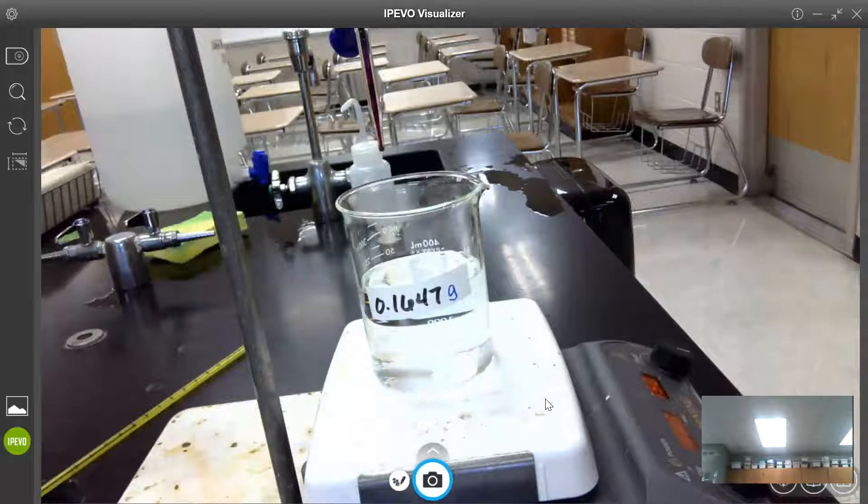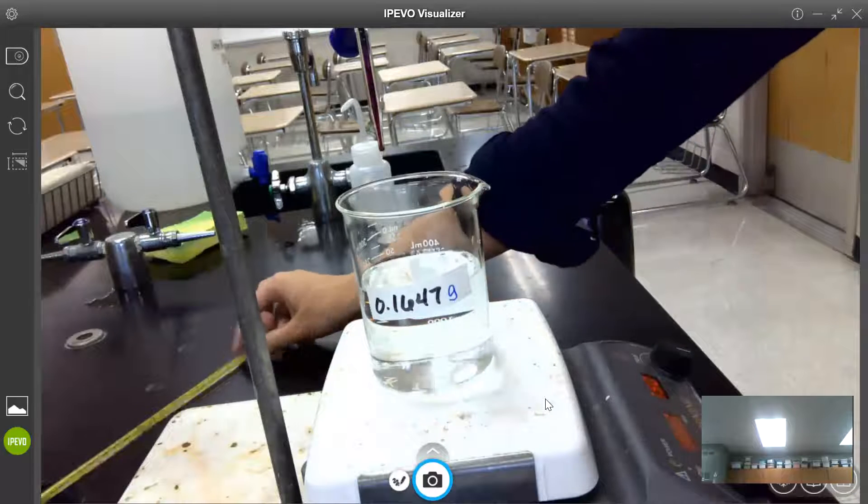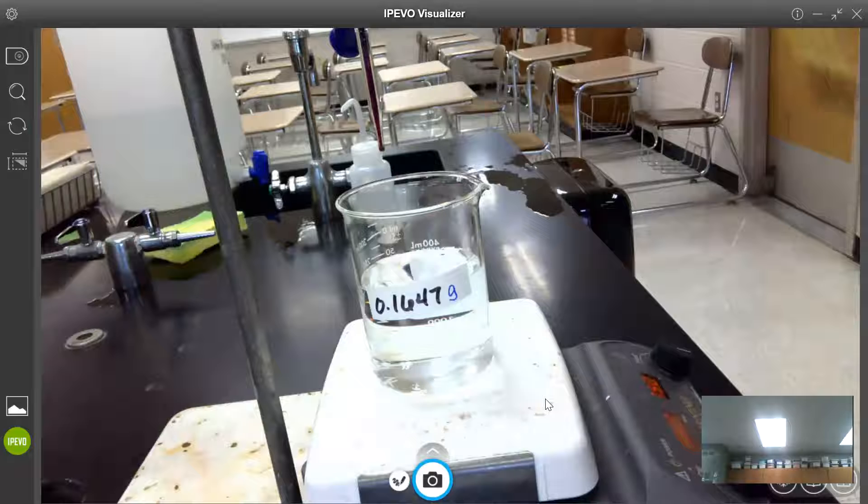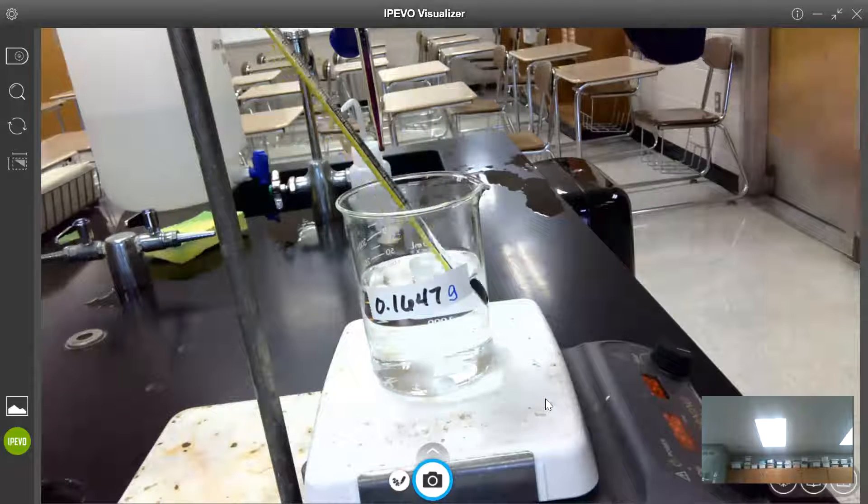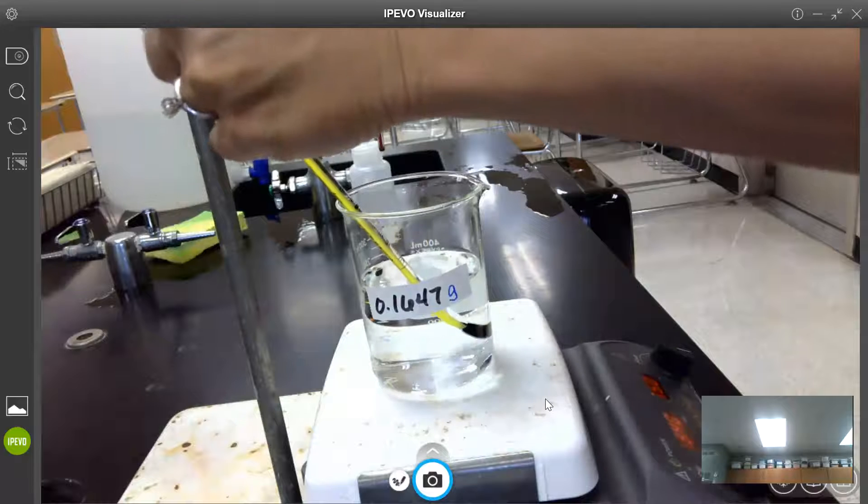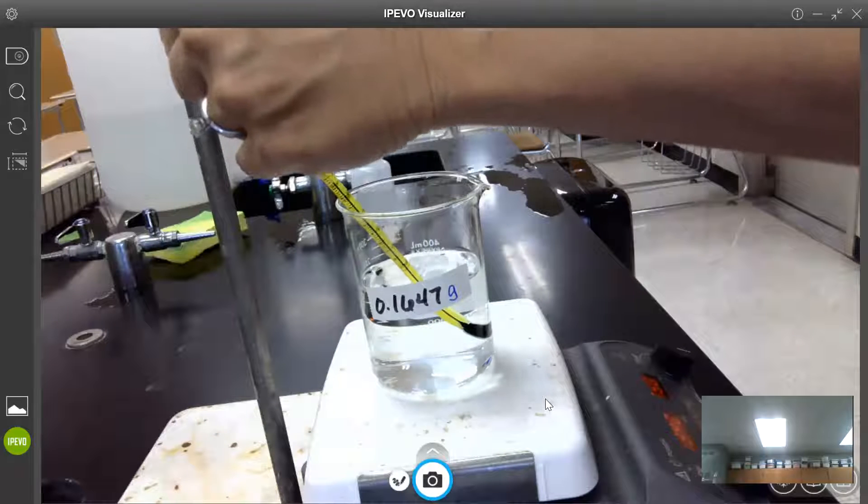So right now I'm getting the sodium oxalate to dissolve in the acidic solution. I'm also going to put a thermometer in to monitor the temperature here as I'm heating it.